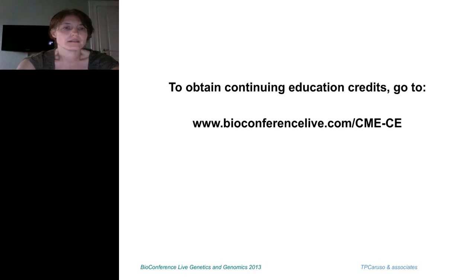Okay, next question is, what next generation sequencing platforms are CLIA certified? If none of the next-gen sequencers are CLIA certified, can we use the results for clinical decisions?